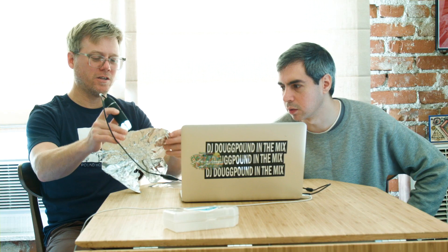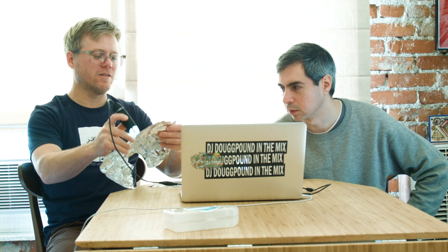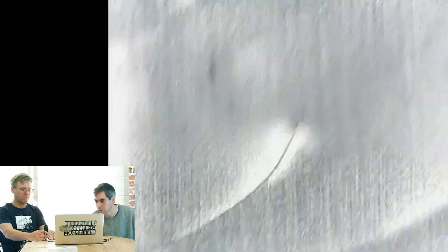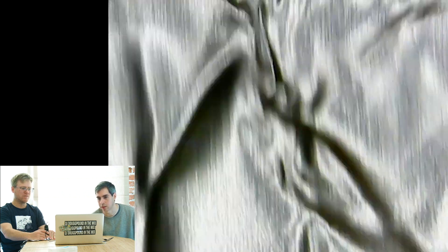Iridescent. Let's look at the other side. You know how there's one shiny side and the other side is kind of dull? Duller, yeah. Let's go to the dull. Look at the dull — dull is quite dull over here. It's interesting that it's so dull. It's not as iridescent.